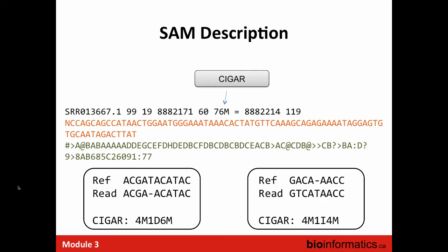Would you see something in there for the larger structural variations, or would things just fall apart? You usually can't do large structural variations with cigar strings. Like inversions, there's not a representation of. Usually what will happen, a cigar example I didn't use is the soft clipping. If a read gets soft clipped, it'll say 50S, and that just means that the last 50 bases of the read weren't aligned. So usually when you get structural variation, you end up with soft clipped reads like that.